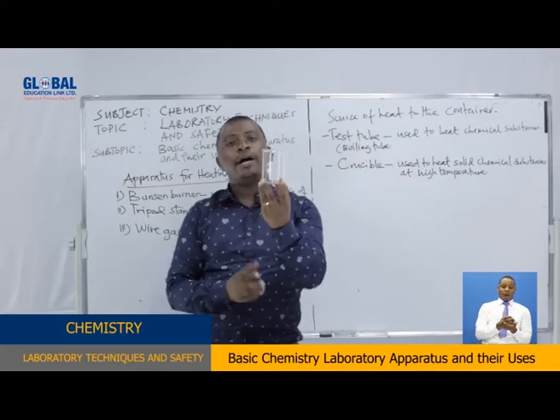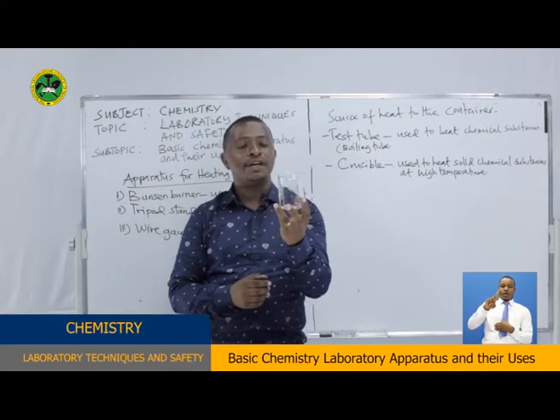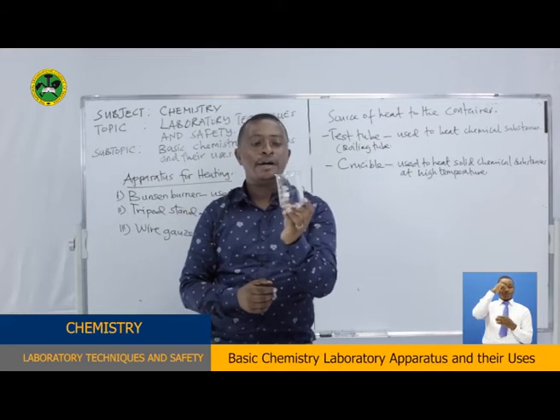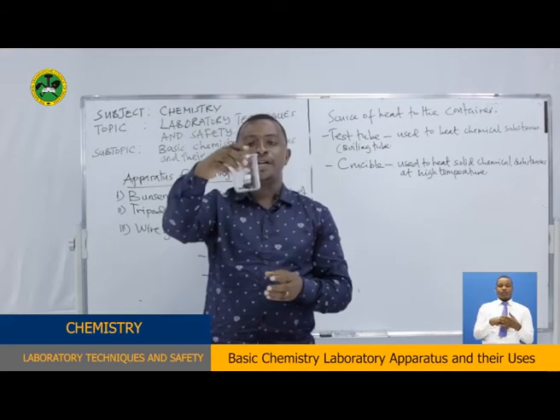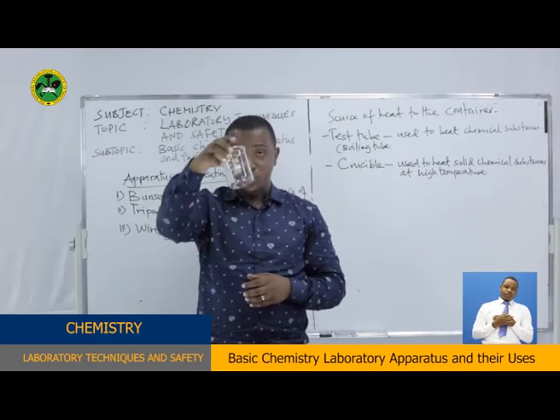This is a beaker. It can also be used for heating different chemicals within the laboratory. Beaker, it's transparent, you can see it. It is also used for heating.